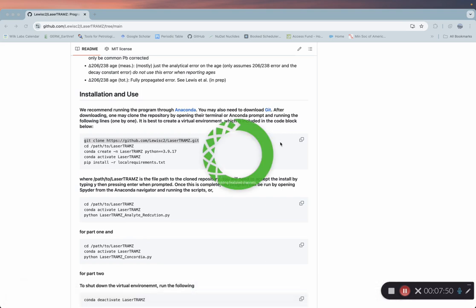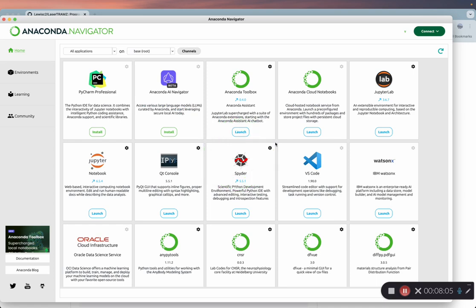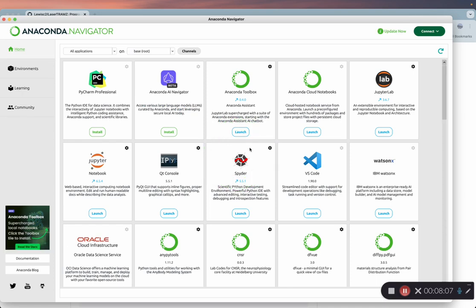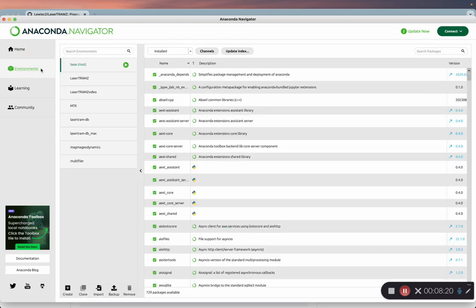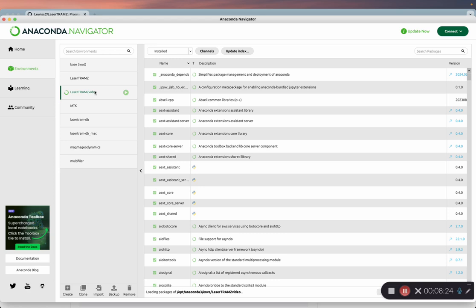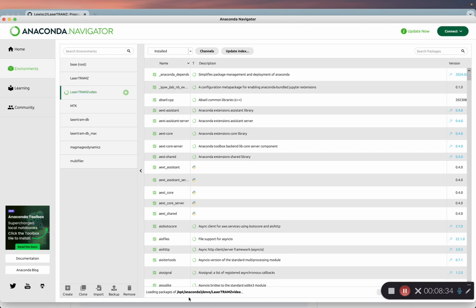Now that we're in Anaconda Navigator, we're going to come over here to the left-hand side, go to our environments, and click on LaserTramZ video, or for you, it might just be LaserTramZ.